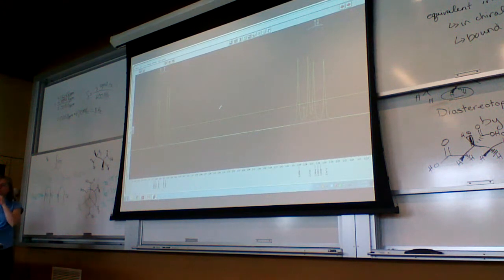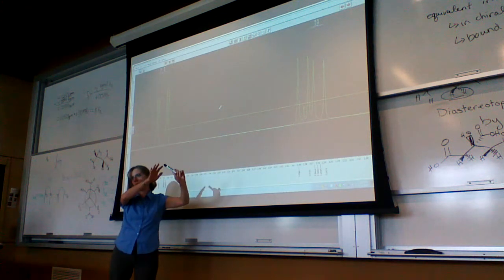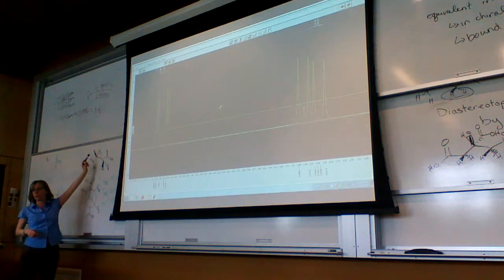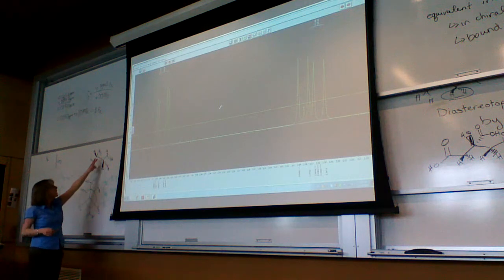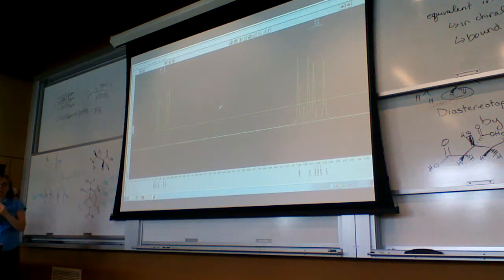Sammy? I think I missed how to tell which number goes with which hydrogen. How did you know that 15.5 went with B and C? 15.5 I can tell because they are the 2 peaks that are more upfield. Okay. And they're more shielded. And just based on the molecule here, I can tell that those are going to be those 2 signals. Okay, so the chemical shift value. Chemical shift value can help you discern that. And then for the AB and the AC I did based on the angle. Again, I may have those backwards, but I'm pretty sure it's this way.